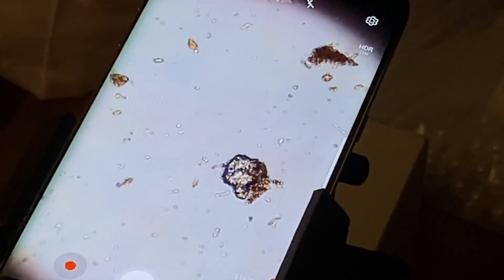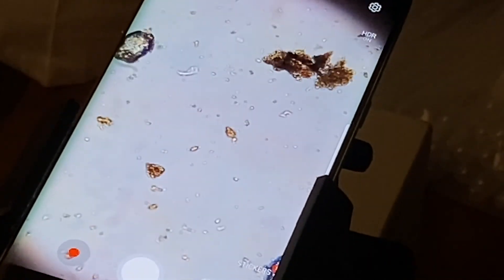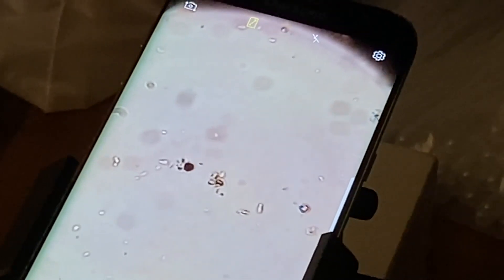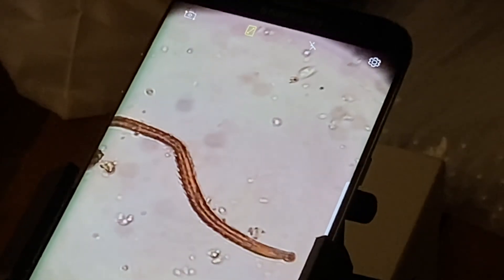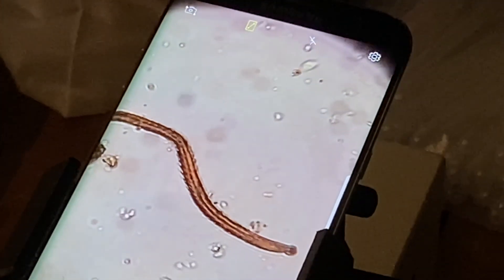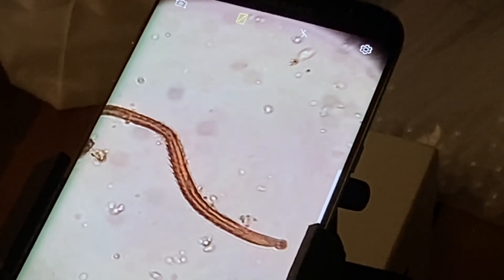Lots of mineral particles, bacteria. There's some bacteria moving around. Probably a few clay particles. Maybe a dead nematode? Yeah, there's a little mouth on it. Looks like a dead nematode.